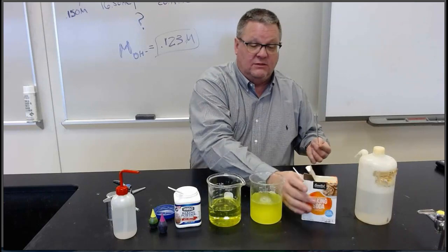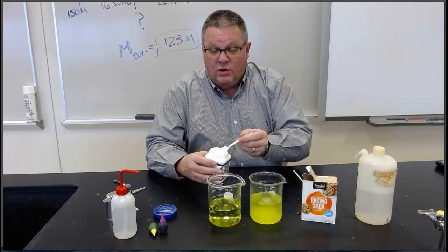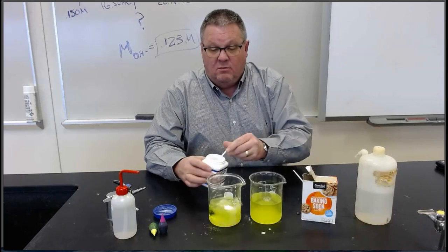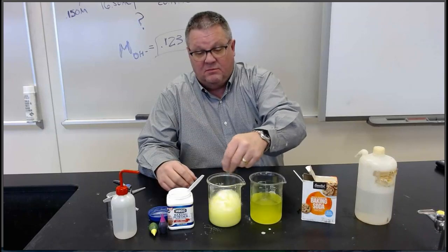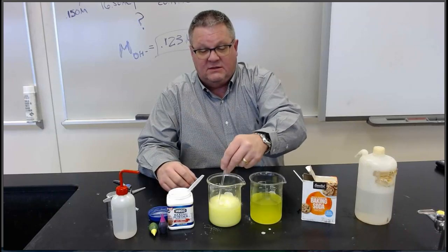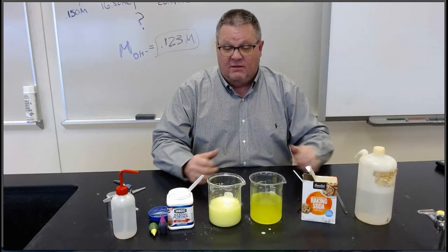There's no acid. Okay? And for the baking powder, you would expect to see bubbles formed because, and you can see them, the haziness there is the bubbles coming up through the water, because there's acid and base together.